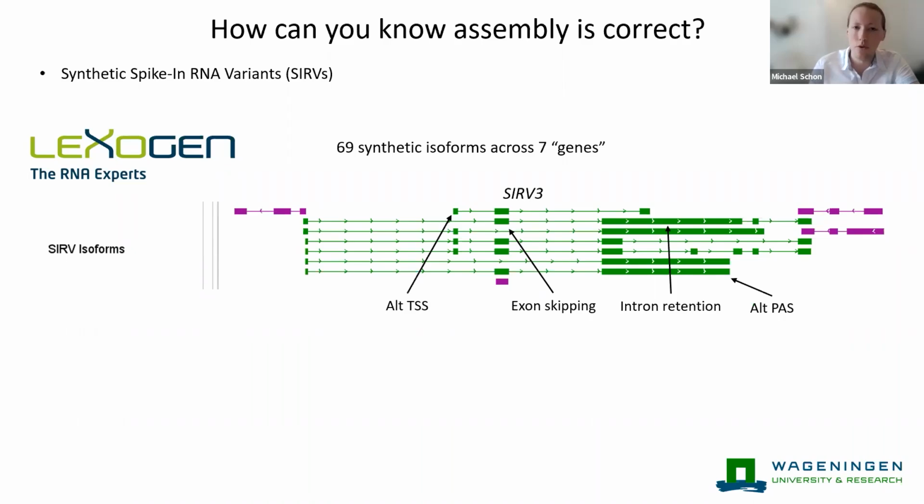They also have alternative transcription start sites and polyadenylation sites in the synthetic molecules, as well as a collection of antisense RNAs, which can really have a negative impact on both annotation and quantification if you're not very careful. So a more complex ground truth included in a sequencing experiment can go a long way to informing you how correct you are.